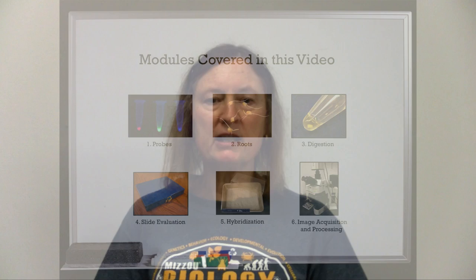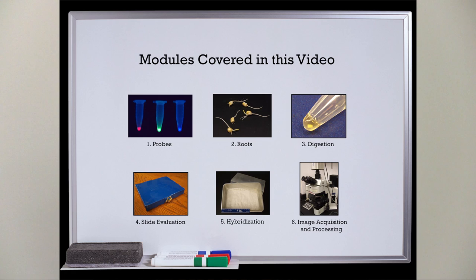The remainder of this video is organized into modules covering each of the pertinent steps in the FISH process. Please pause the video to read the tips and helpful hints presented at the end of each section. The protocols presented here are by no means the only way to do FISH, but are simpler than many methods. Please regard the protocols as guidelines with a considerable amount of flexibility at most steps. In fact, no two people, even in our lab, do FISH exactly the same way. So adapt the protocols to fit your species, applications and goals, and most of all, have fun.